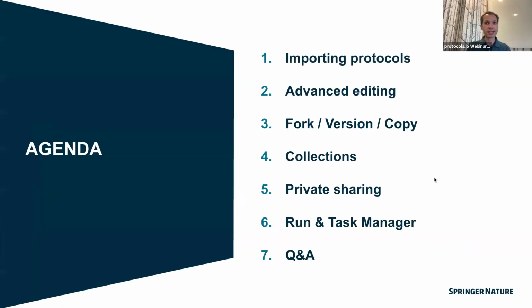So with that said, here are some of the things we'll be going over today. We will look at some of the components, advanced editing inside Protocols.io. We'll start with importing existing methods. I'll do a live demo of how I would put a new protocol in from an existing PDF or Word file. And then we'll cover some of these other topics and go into Q&A as well.